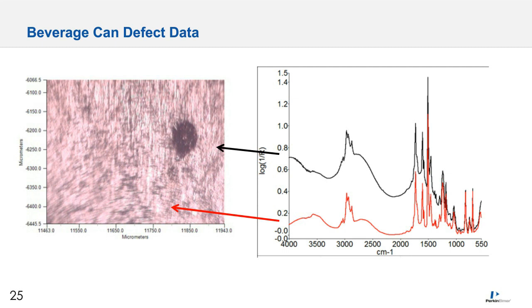Note that we still observe spectral bands of the coating at the position of the defect, so the coating has not been eliminated or displaced by the presence of the defect, and no additional spectral bands appear in the measured data. This means that the particle is likely either carbon, like char, or metallic in composition.